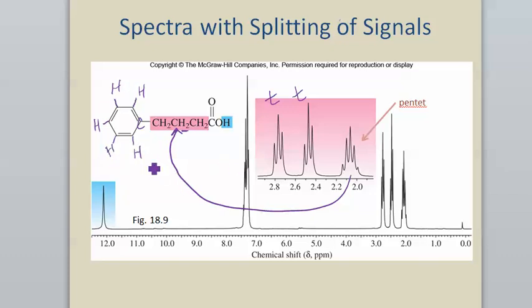Those 5 hydrogens are giving rise to this jumbled peak here. That's not really a simple splitting pattern, but it is a cluster of very closely spaced peaks that are all around 7.3 or so, right in the range we would expect for the hydrogens on a benzene ring. So this structure does correlate with all of the peaks in that spectrum, and there are no peaks for which we cannot make sense. And notice again, this over here at 0.0 is our TMS. That's just our standard, and otherwise there's no peaks that are showing up that we can't associate with hydrogens in the molecule we have there.